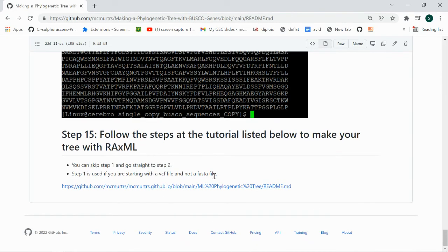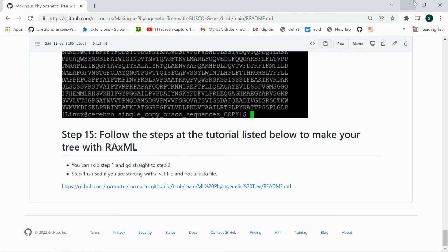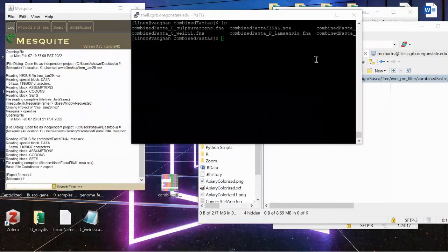Once you get your new file back on the cluster, then you can move to step 15 here and go to this link, and there will be steps on how to do the RaxML maximum likelihood tree using BUSCO genes.